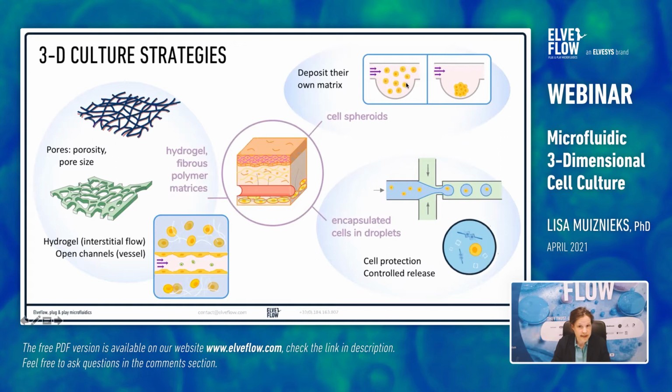Using microfluidics, cells can be flowed through channels and left to deposit into microwells. Once formed, the spheroids can be used for high-throughput drug screens by flowing drug gradients across the chip. Spheroids made on chip have controlled and reproducible size, ideal for comparative studies of drug penetrance and efficacy. But the main focus of today's webinar will be the 3D hydrogels made on chip. Let's now look at some microfluidic chip designs that enable control of molecular gradients over cells in 3D culture.